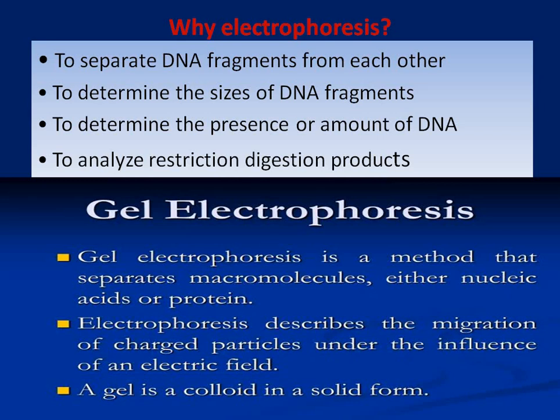We can easily determine this by comparing with different ladders of quantified amounts run along with the DNA samples in the electrophoresis process, to analyze the restriction digestion products.